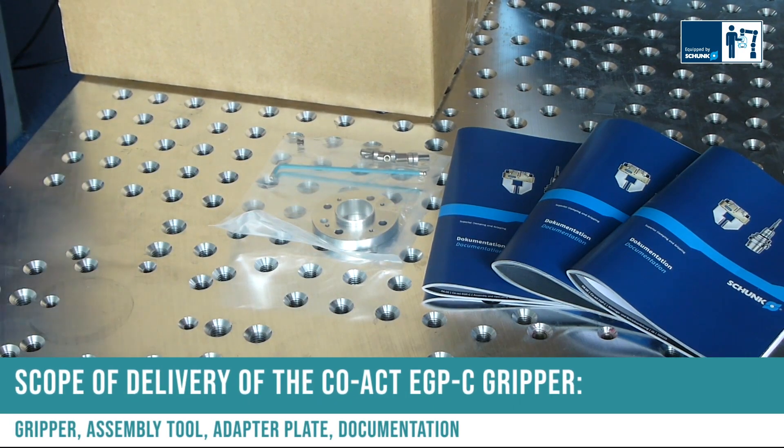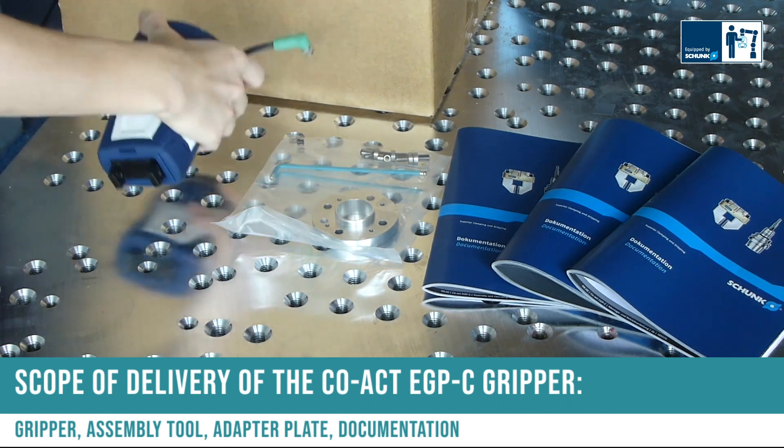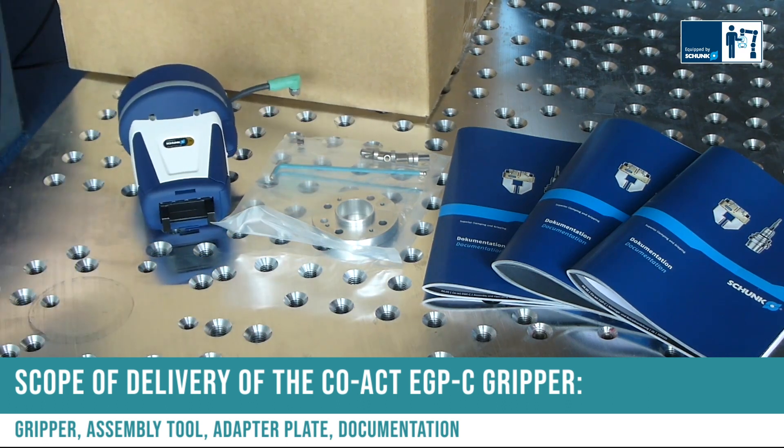Scope of delivery for the Coact EGP-C gripper: gripper, assembly tool, adapter plate, documentation.